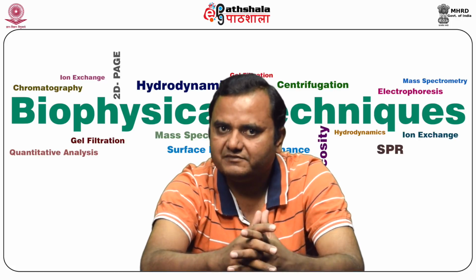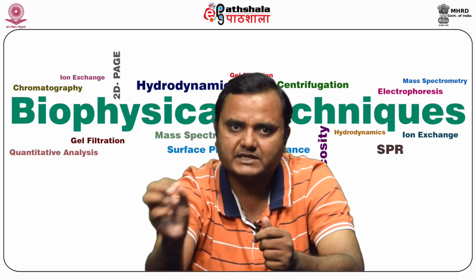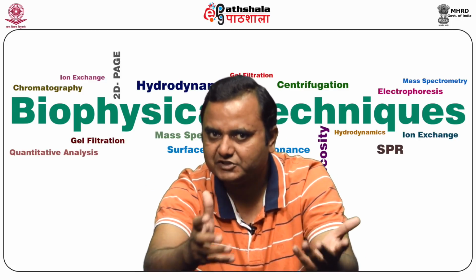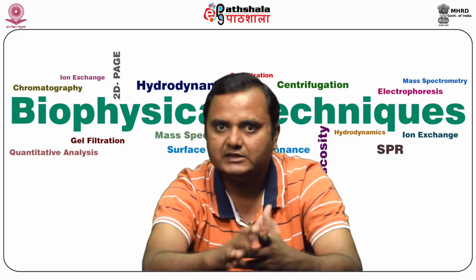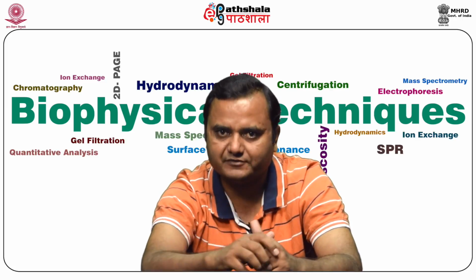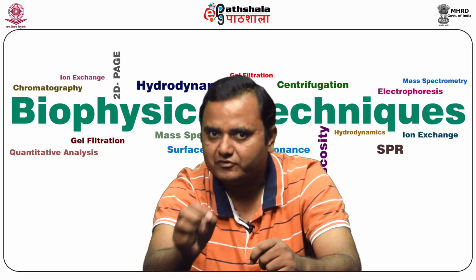So that is the widely used technique for the fractionation of the cell organelles. I'll give you a brief description of differential centrifugation. This technique is sometimes also referred to as differential sedimentation. As the name indicates, differential means that it differs in mass and size, and it is essentially a process of successive centrifugation, single or repeated steps with increasing centrifugal forces.